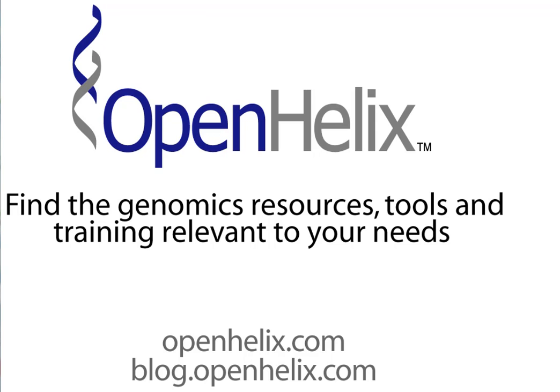Today I'm going to be talking about DomainDraw, which is a handy tool to illustrate protein structure diagrams with motifs. And I won't be able to cover everything that DomainDraw offers today.